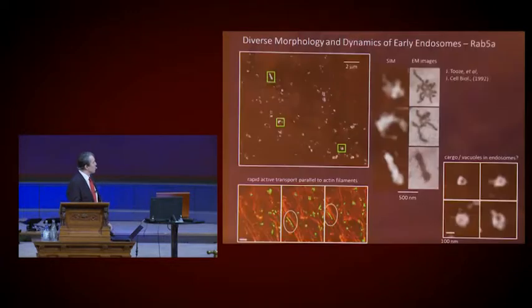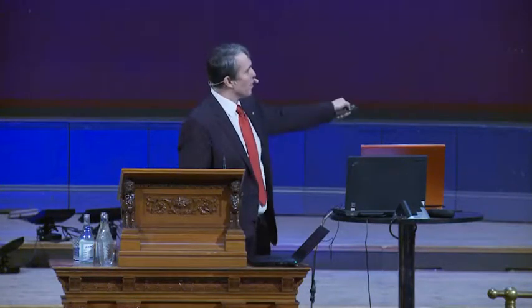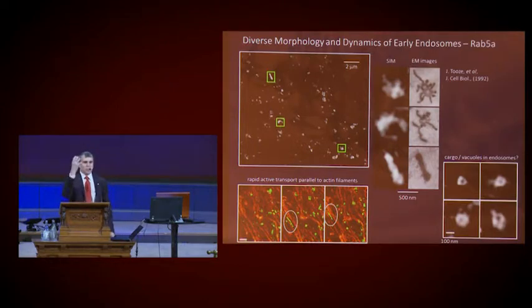And what we've been able to see is a number of things. Unlike the clathrin-coated pits, which have a very stereotypical round shape to them, those rings, the early endosomes have crazy irregular shapes. So I picked 3 examples here, and I picked them carefully to match an EM paper that appeared 20 years previously, but you can see that we can now start to see these shapes.